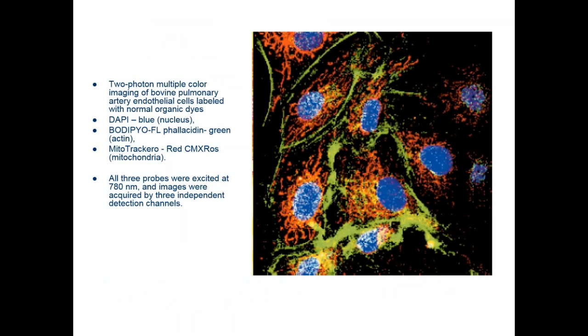Different dyes were integrated or absorbed to these different parts, and the use of two-photon excitation enables you to see all these dyes in one experiment versus one dye excited with one type of light. So two-photon experiment absolutely allows you to get these beautiful images with lots of information.